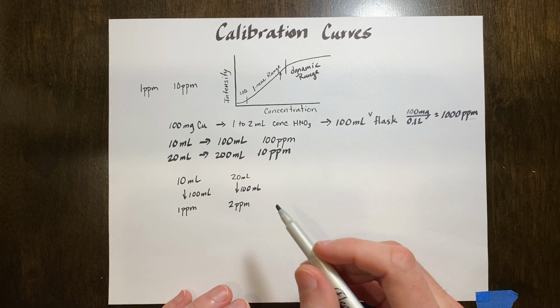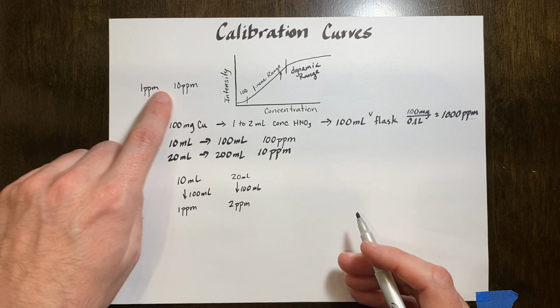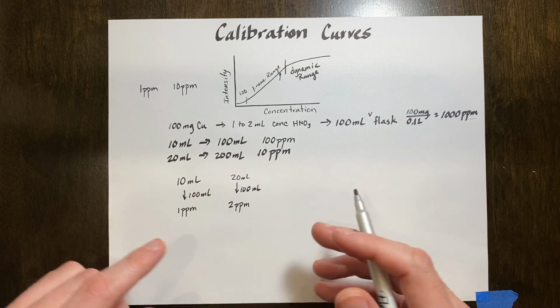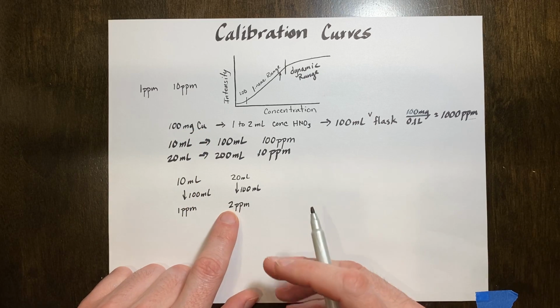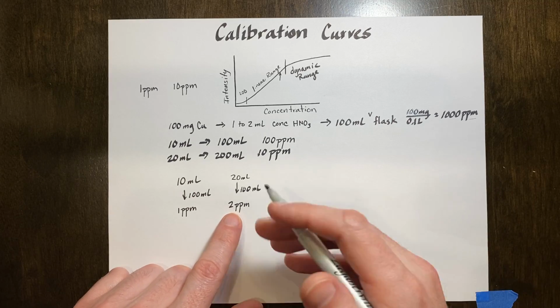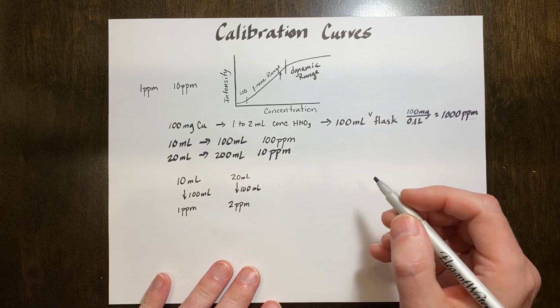And yes, it's actually copper nitrate, but because I measured out 100 milligrams of copper metal, it's actually easier just to say 2 parts per million of copper metal. And then, yes, there's some other nitrate in there, but not important.